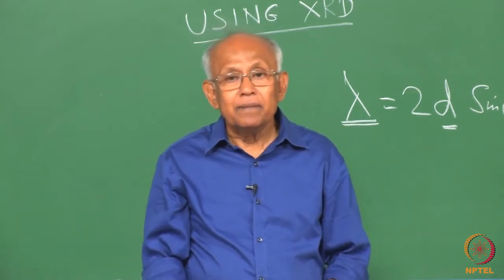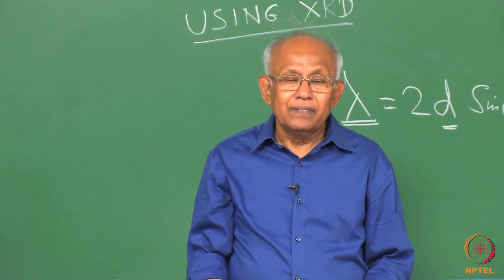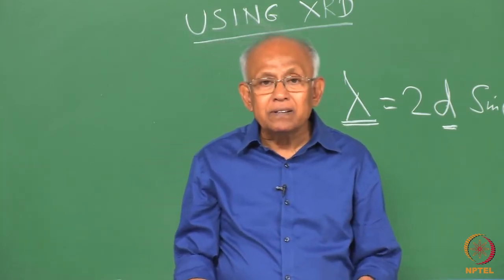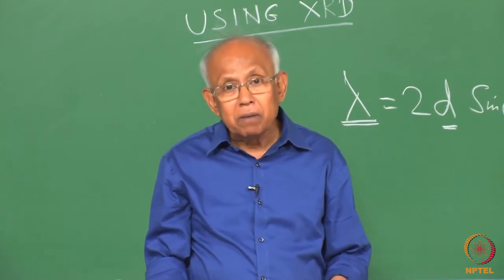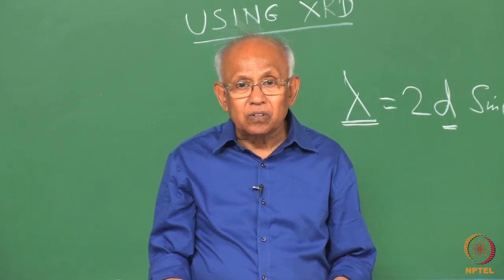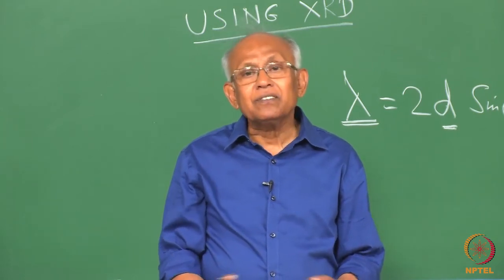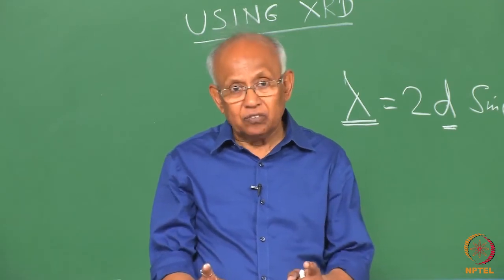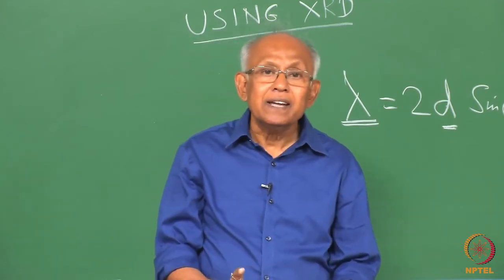In a similar way, just by examining the X-ray diffraction pattern, when I call X-ray diffraction pattern, two things must be kept in mind: the positions of the lines as well as the relative intensities. So, when we talk about an X-ray diffraction pattern, it is unique for a particular phase, an element or a compound.